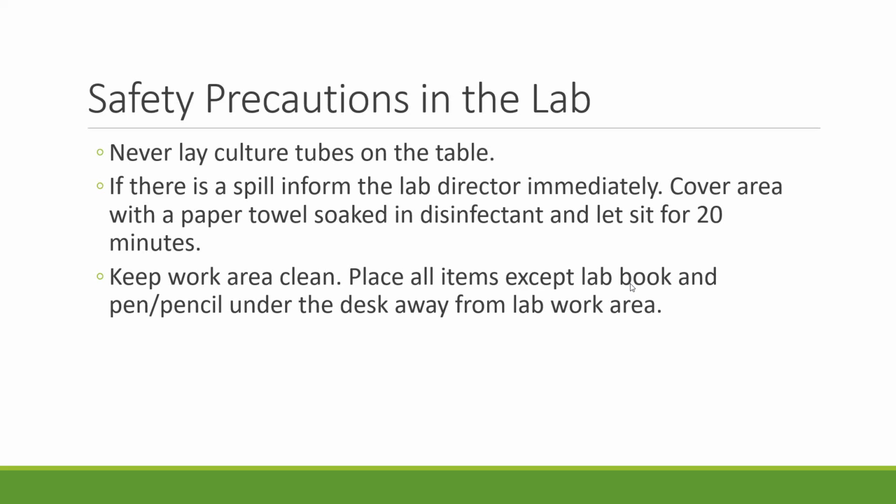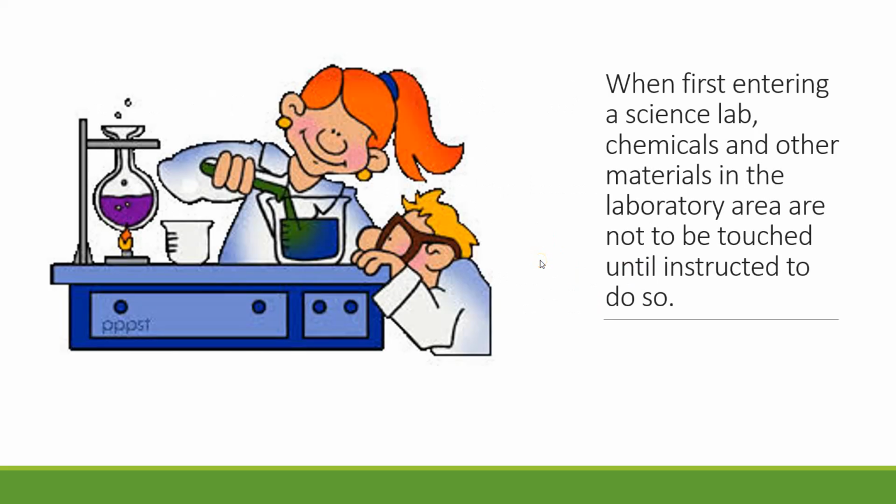Even in the lab setting, pens and pencils don't go from the desktop to book bags, because if you're writing with gloved hands in your lab papers, then guess what? You just contaminated a pen, and then you just put it in your bag. Maybe you went home and you have a small child who loves playing with mom's or dad's stuff and pulls that pen or pencil out and sticks it in their mouth, etc. These things are easier to understand when you're in lab and thinking about it, but I do want to make you very aware of some of those safety precautions that you would have to take if you were on site.